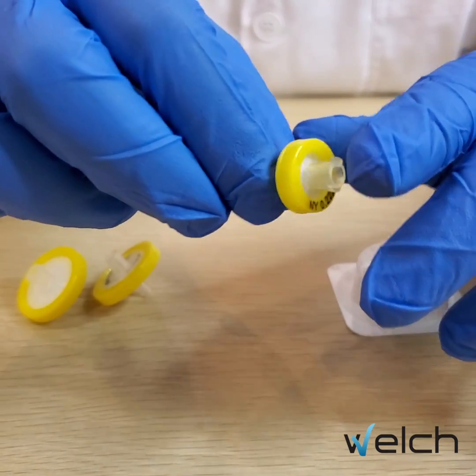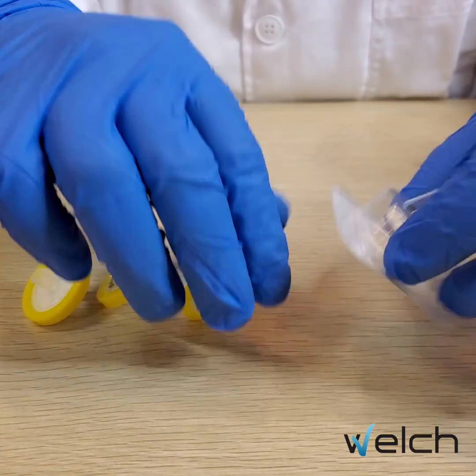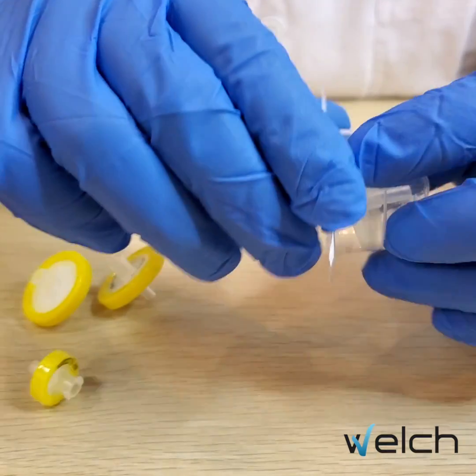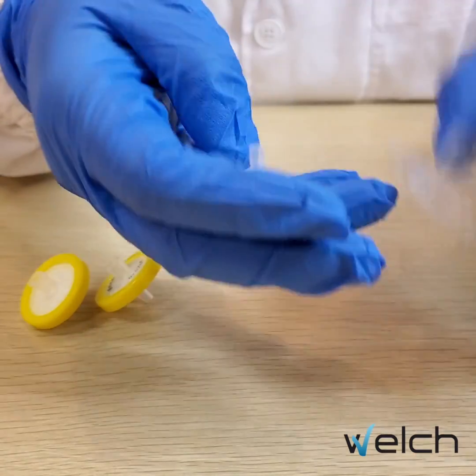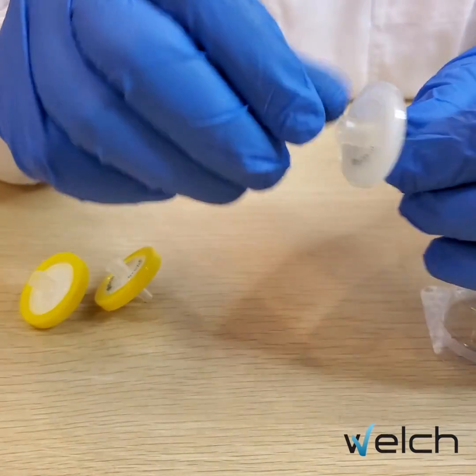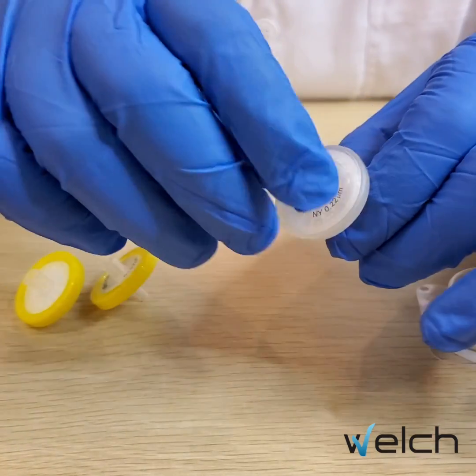The double layer syringe filter has printing on the body but there is no brand name — it can also be customizable. The single packed sterile syringe filter is also printed on the body but doesn't have the brand name, and it can also be customizable.